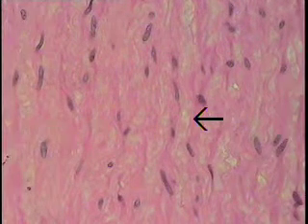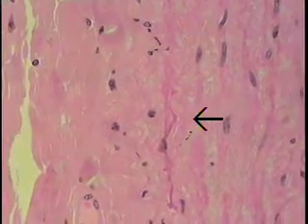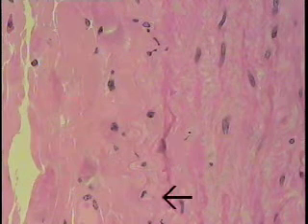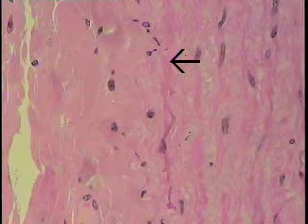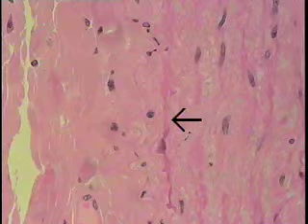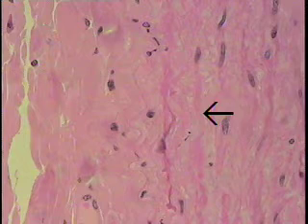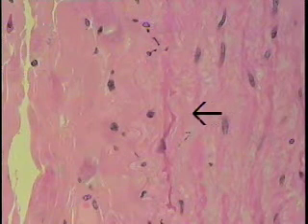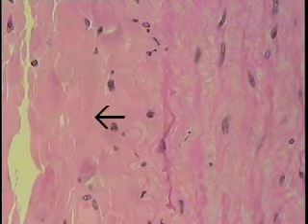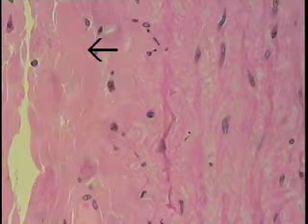Now, as we continue to pass through this thick tunica media, finally we run into some elastic laminae, called the external elastic lamina, that separates the tunica media with its smooth muscle, elastic fibers, reticular and collagen fibers, all produced by the smooth muscle cells in this particular area, from the adventitia, shown here, which consists primarily of collagen fibers and fibroblasts.